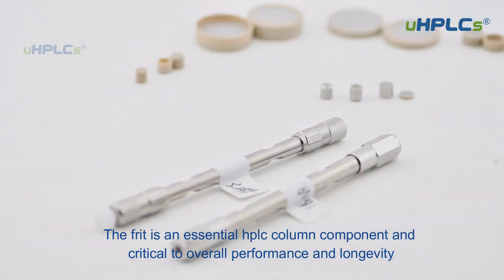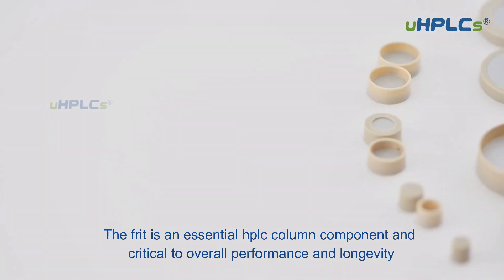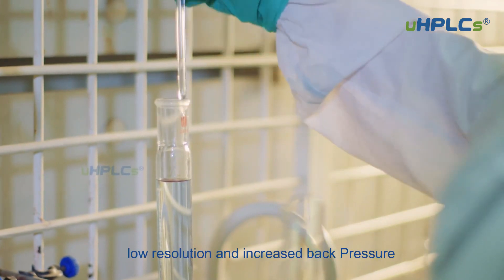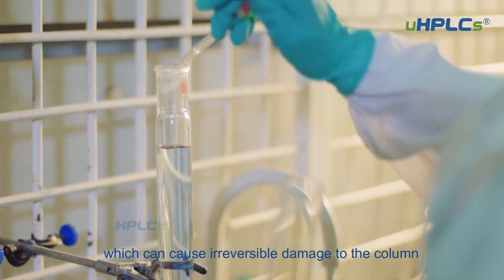The frit is an essential HPLC column component and critical to overall performance and longevity. A damaged or clogged frit can lead to poor separation efficiency, low resolution, and increased back pressure, which can cause irreversible damage to the column.